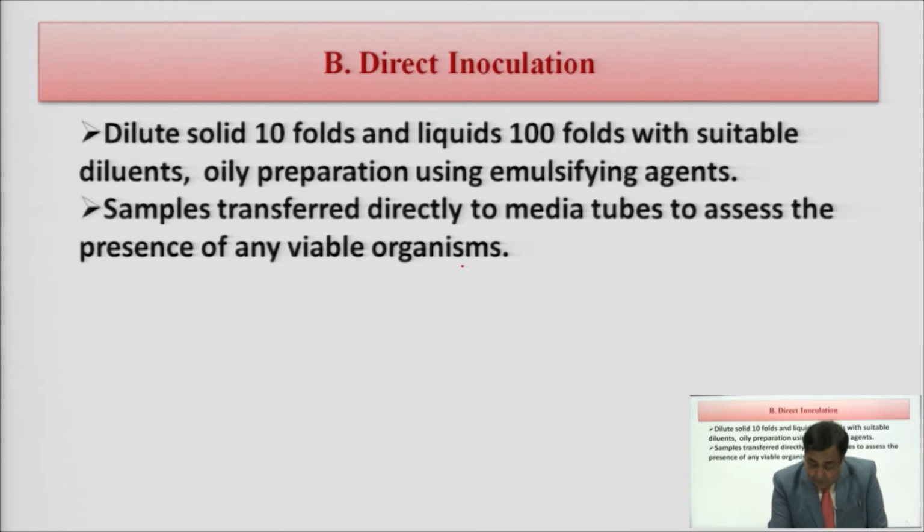And if the media in the tubes turn turbid, or lose their transparent character, it means that the substance which you are testing has not been properly sterilized, and hence it will not pass the sterility testing.